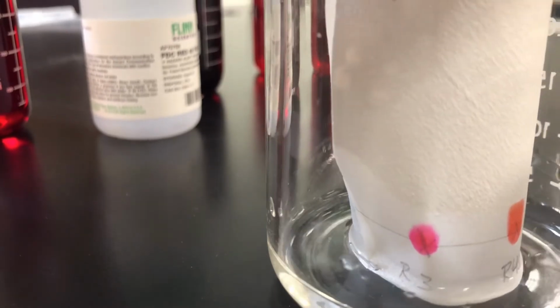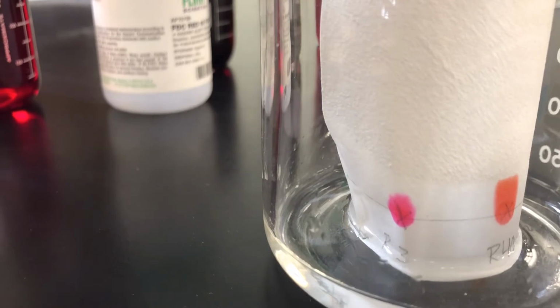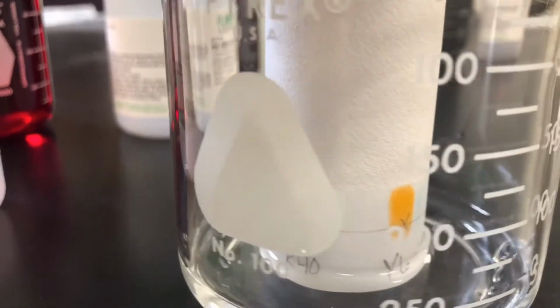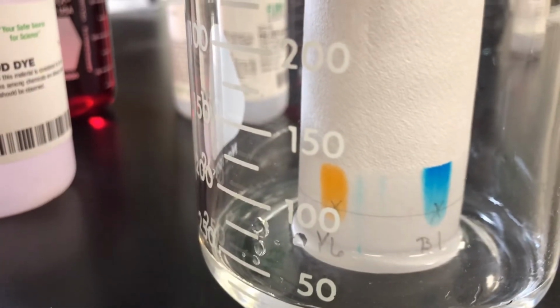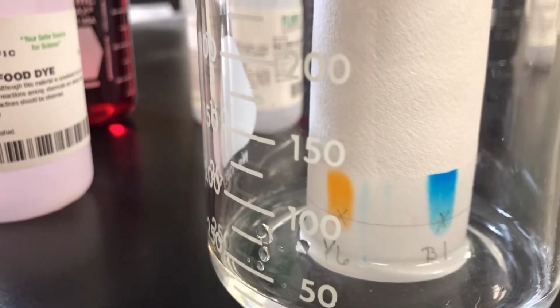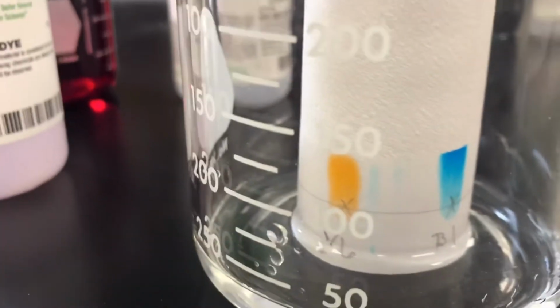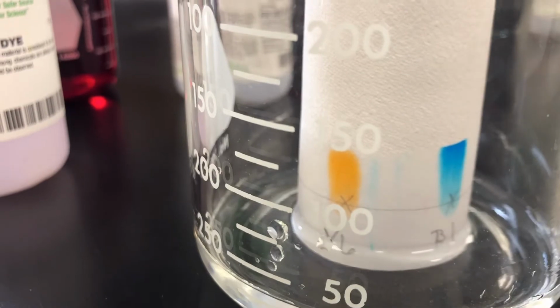Some of it will move faster, some of it will move slower. So obviously this red 3 doesn't move quite as fast or as easily as the red 40. The yellow number 6 seems to be working well. And somewhere we got a couple little tiny dots of blue dye somehow on our paper. But the blue is moving very, very well. Notice all of that at the bottom, almost all of it, is trying to move away. There's not much blue down there, okay?